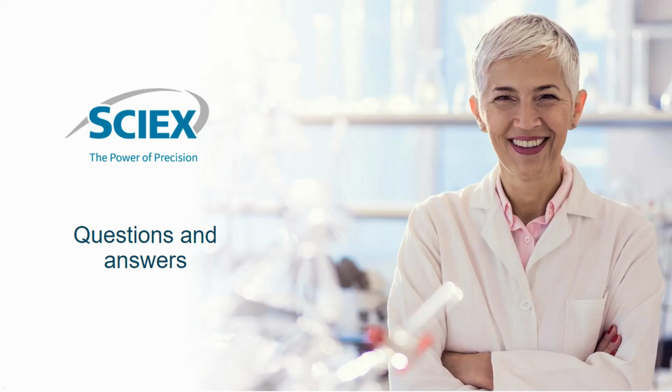Great, thank you. Next question here asks, what versions of Empower is BioPhase compatible with?